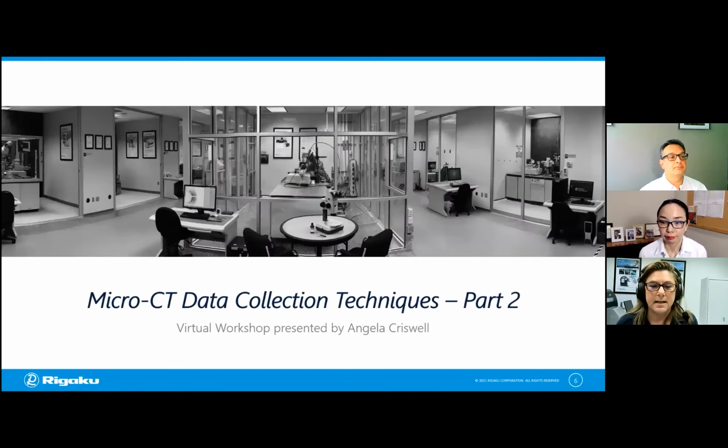Thanks, Tom. Thanks, Aya, and thank you to everyone for joining us for the presentation. Like Tom mentioned, today we're presenting live from our office in the Woodlands, where we're going to be giving a live demonstration on micro-CT data collection techniques using Rigaku's CT Lab HX system.